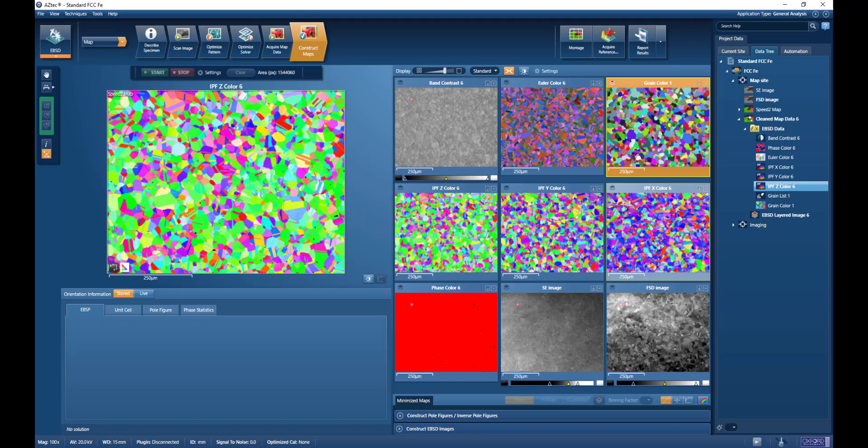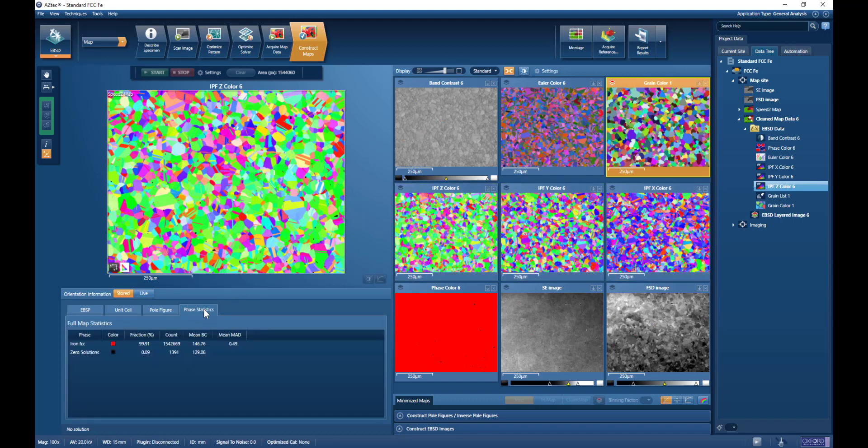Here we can see the basic information, the pattern quality, the orientation and phase maps, and we can look at some phase statistics.